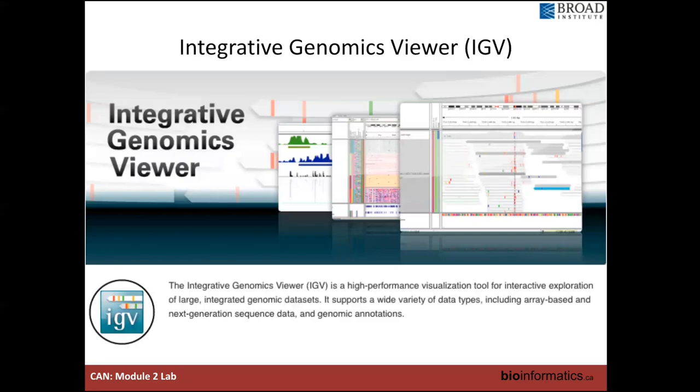We will be using IGV for this lab. It's one of many genome browser tools available. UCSC Genome Browser is a really popular web-based one, but IGV is a pretty popular downloadable one as well, and it supports many different file types. You can look at DNA alignments, RNA alignments, DNA methylation data, ChIP-seq data, VCF files, and many more. But I think most commonly, IGV is used to view DNA and RNA alignments. And these files can be either stored on your computer, or you can actually pull them from the cloud if they're hosted online.